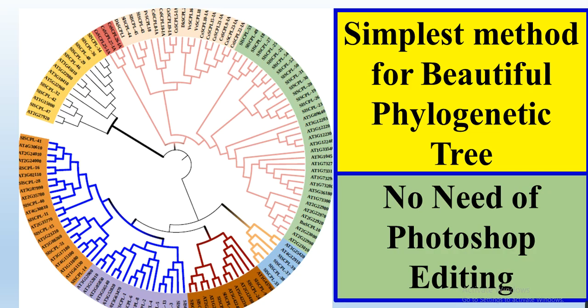In this video, we will learn how we can construct the phylogenetic tree in MEGAX and make it beautiful for our manuscript, research article, or thesis. So how to do it? Let's start.